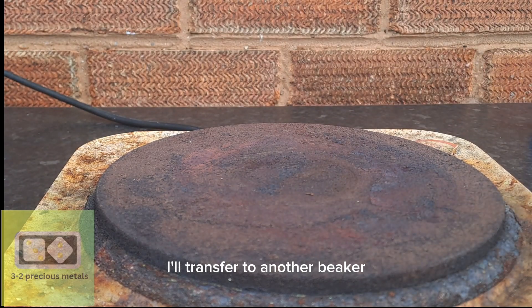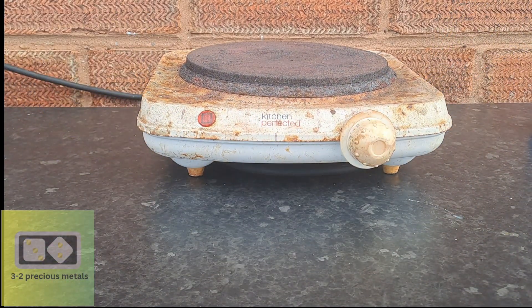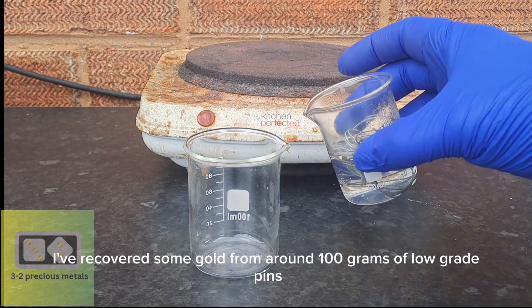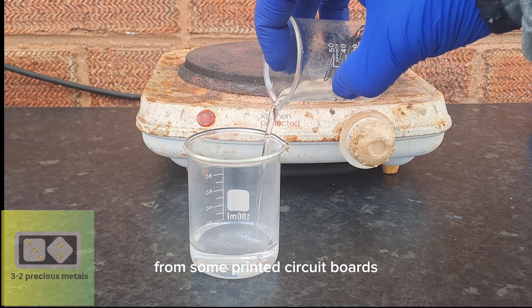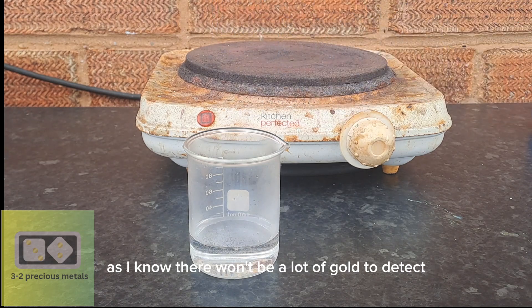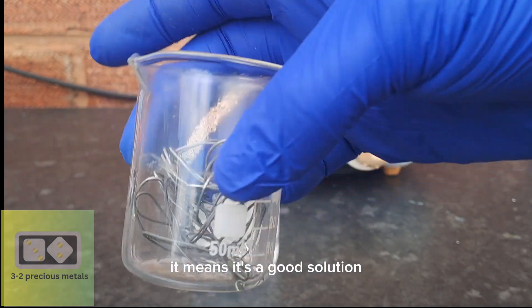I'll transfer to another beaker and give it a test to make sure it works. I've recovered some gold from around 100 grams of low-grade pins from some printed circuit boards. This would be perfect to test my new stannous chloride, as I know there won't be a lot of gold to detect. If it can find such a low amount of gold, it means it's a good solution.